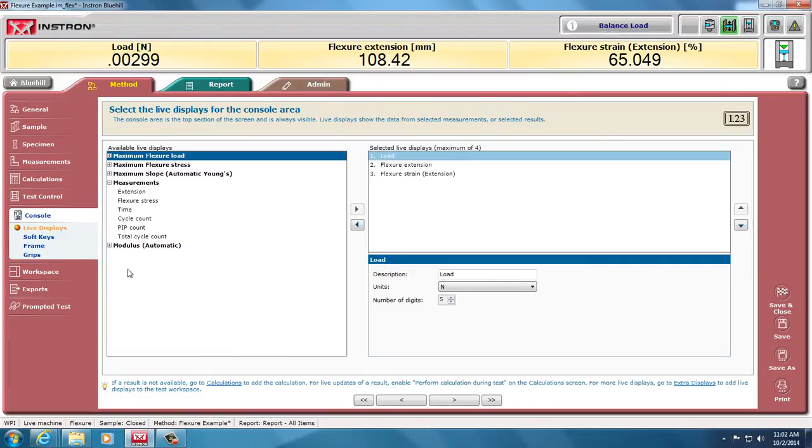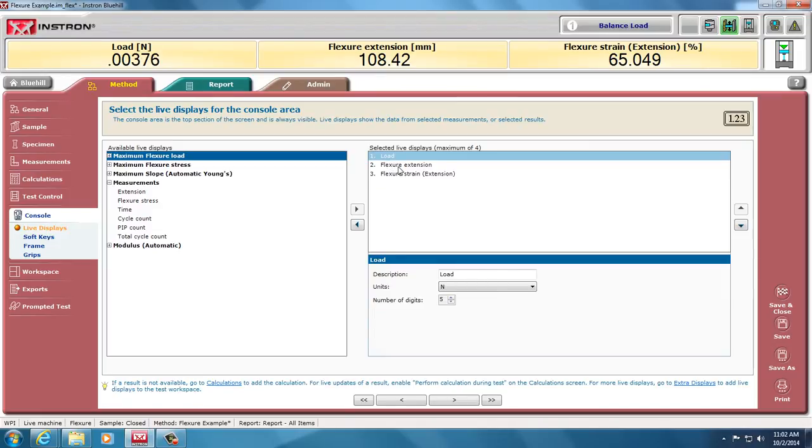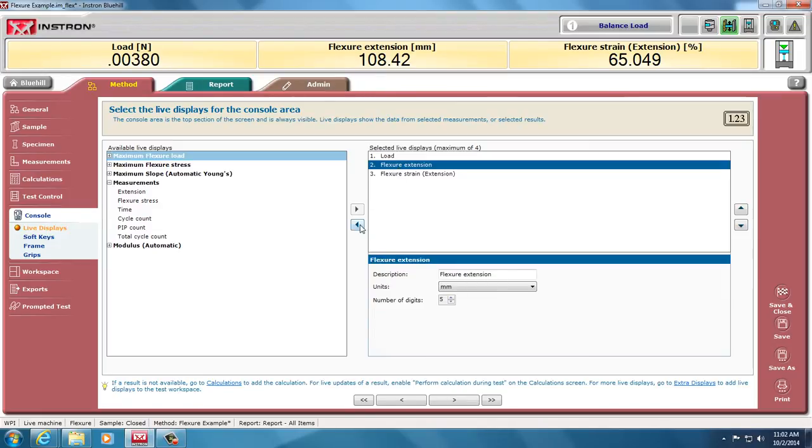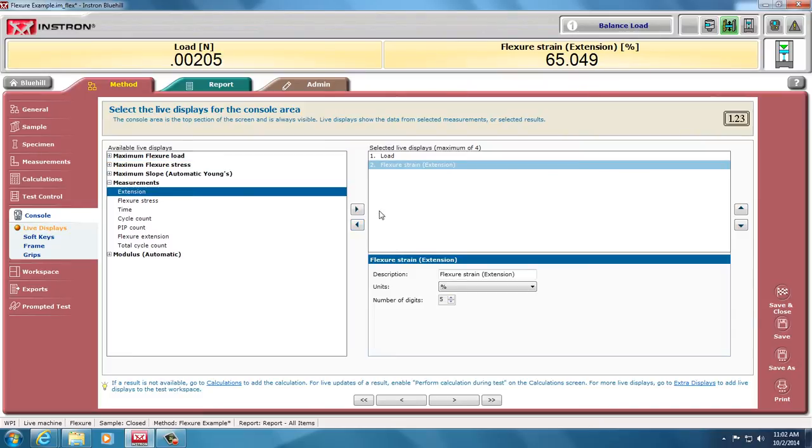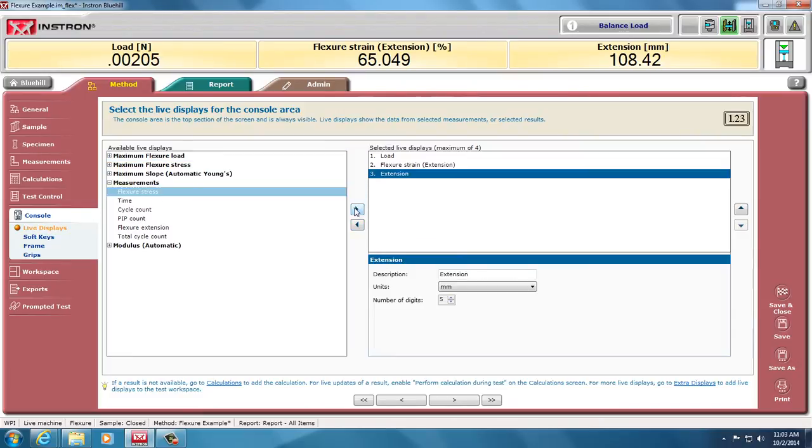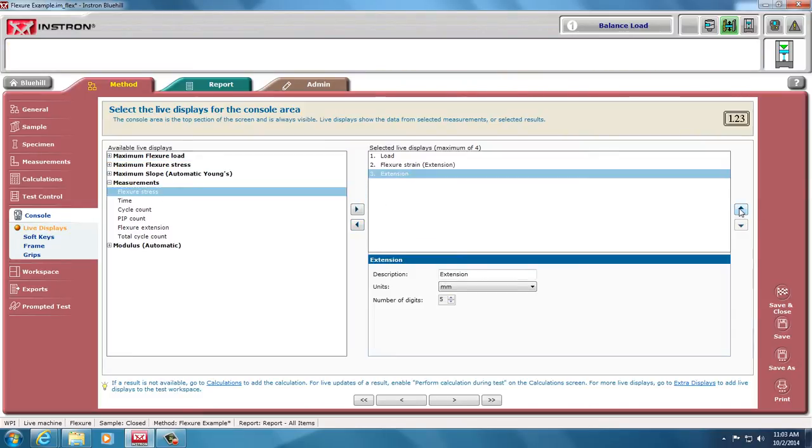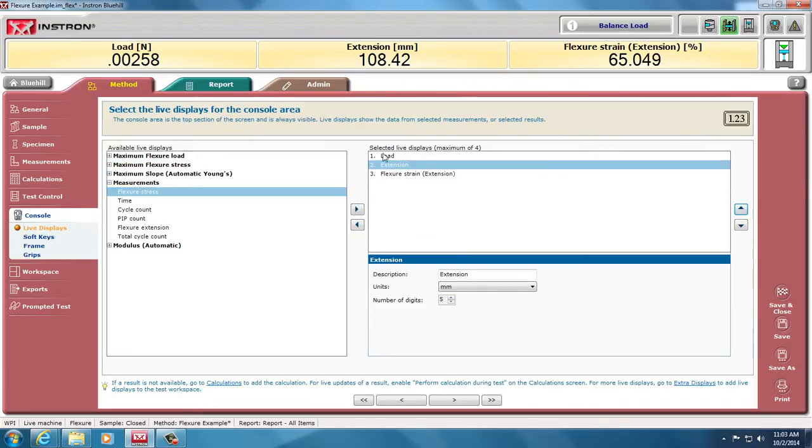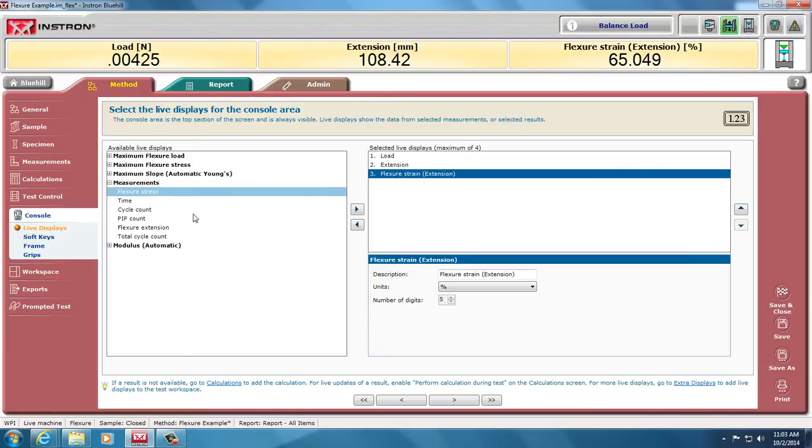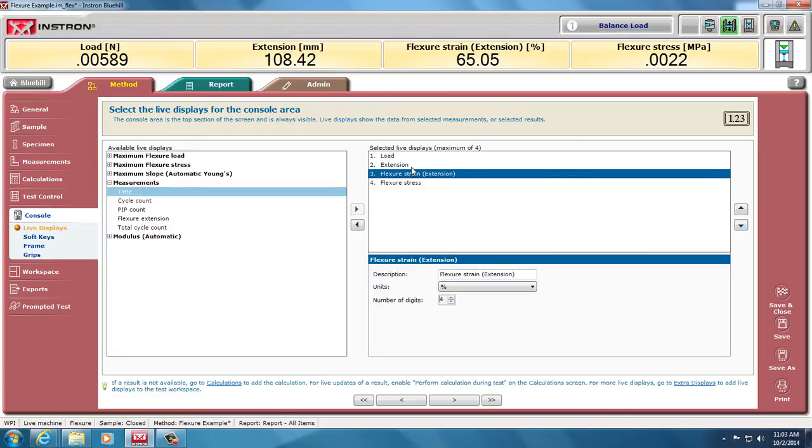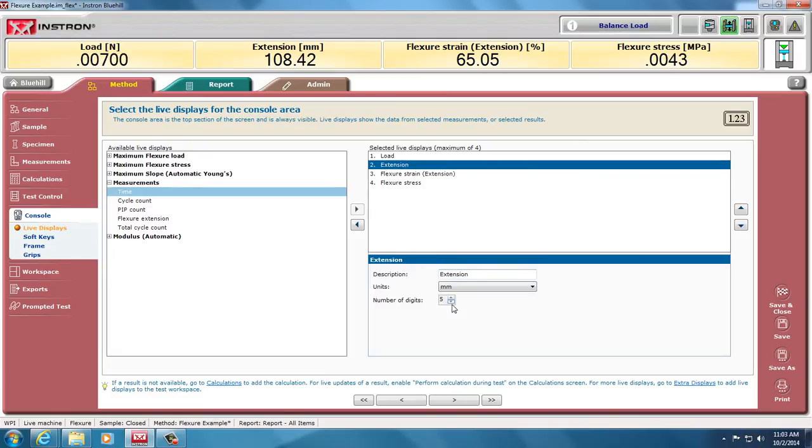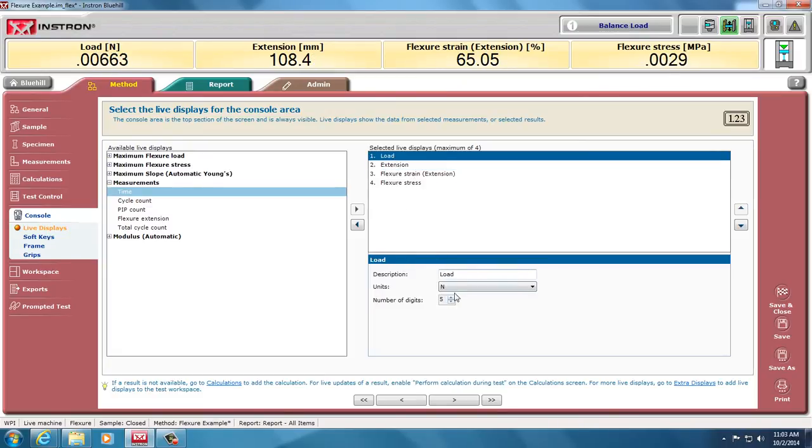In Blue Hill 3, we can set the live displays up here at the top. Right now, they're load, flexor extension, and flexural strain. I would like to have four, and I'm not interested in flexural extension, just regular extension. They are actually the same thing for three-point bending. But those are my raw data and my measured flexural strain and flexural stress I would like indicated. You can only go down to four decimal points, digits. That's more than enough.